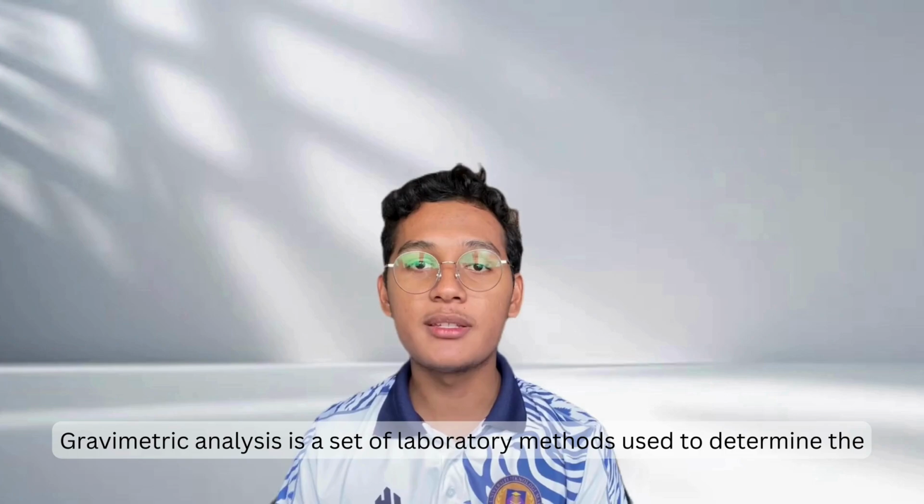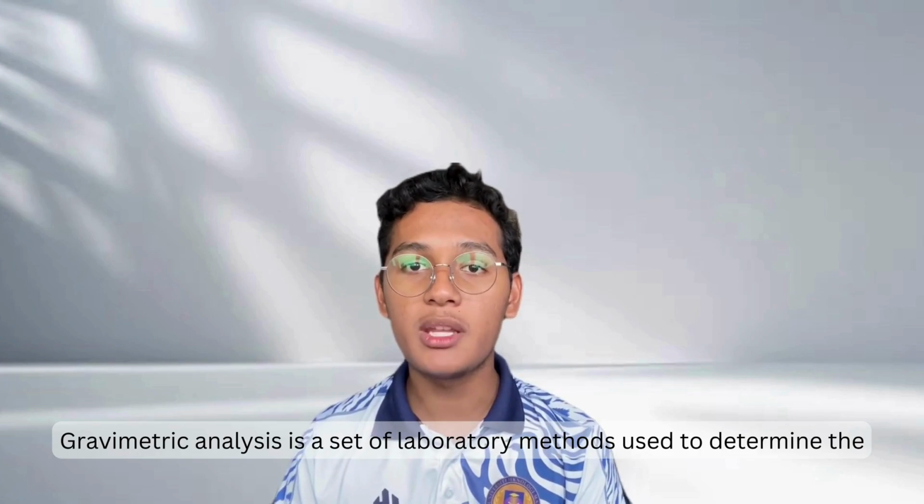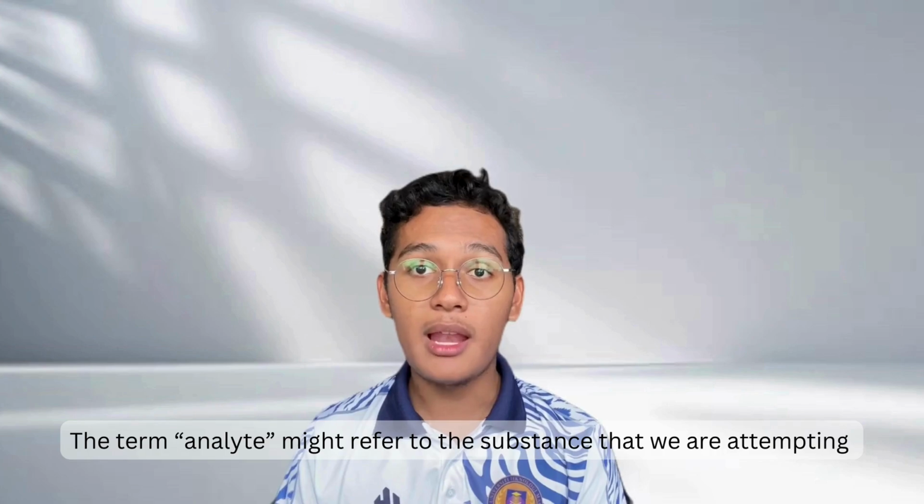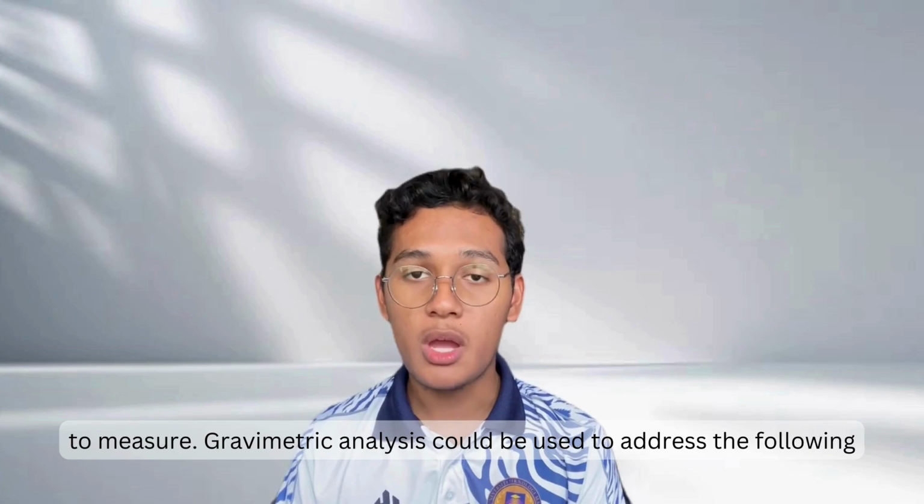Gravimetric analysis is a set of laboratory methods used to determine the mass or concentration of a substance by measuring changes in mass. The term analyte might refer to the substance that we are attempting to measure.